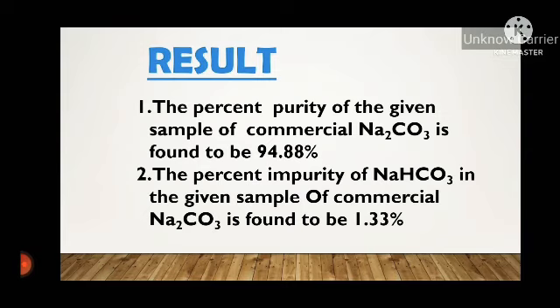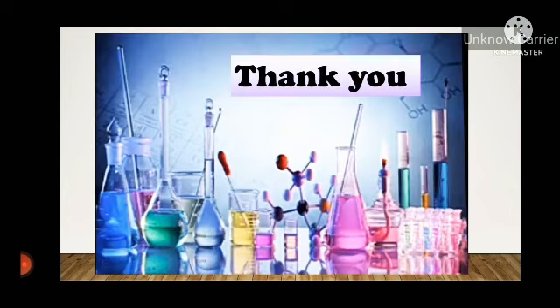Now comes the result. We obtain the percent purity of the given sample of commercial sodium carbonate to be 94.88%. The percent impurity of sodium bicarbonate in the given sample of commercial sodium carbonate is found to be 1.33%. Thank you.